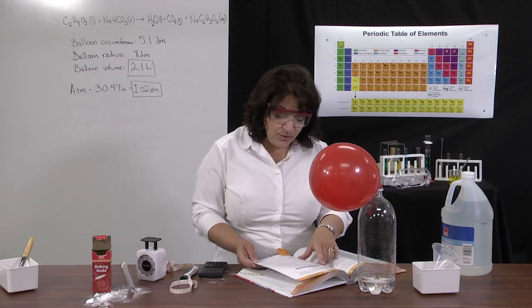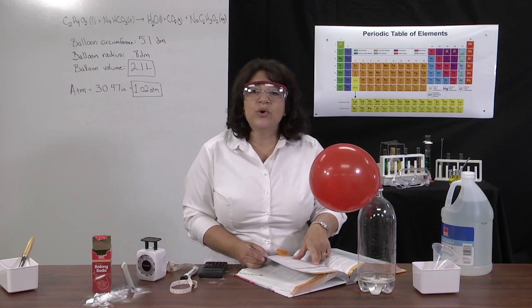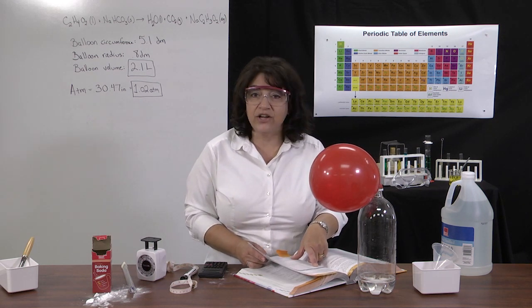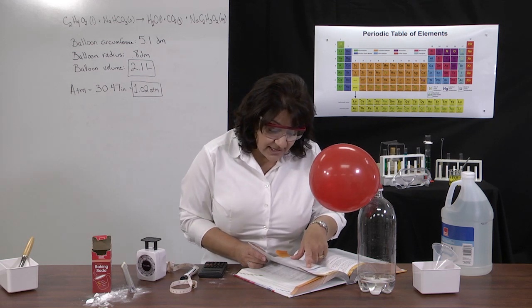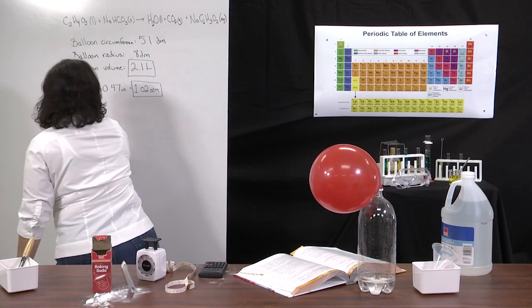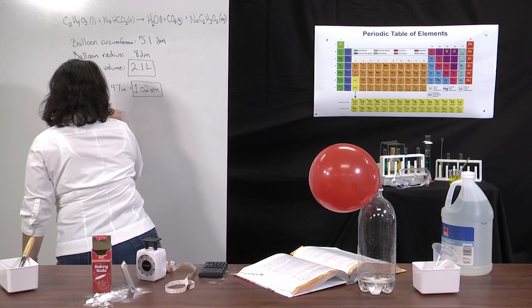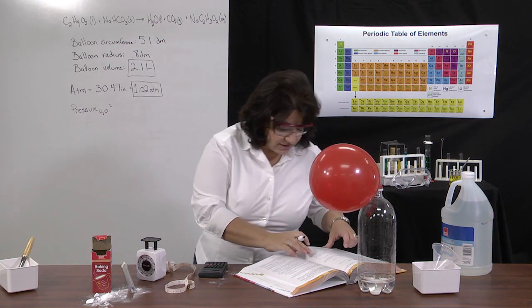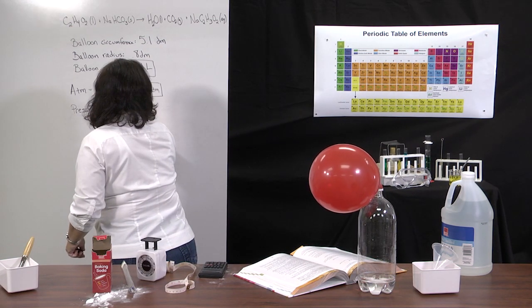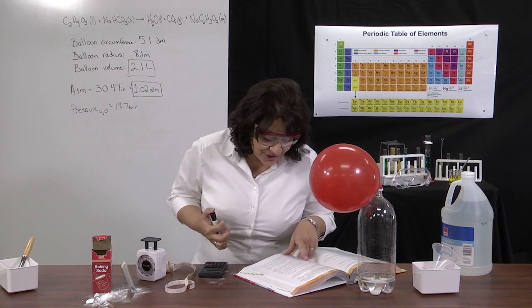Now the table gives you temperature values in round numbers, just to the ones place. So my measurement was 21.1, and I'm going to look at the temperature value in degrees Celsius as 21 on the table, which means the vapor pressure is 18.7 torr. I'm going to write pressure here. Let me double check the number, 18.7 torr. Okay, that's the vapor pressure of water. That's why I put a little H2O under pressure.